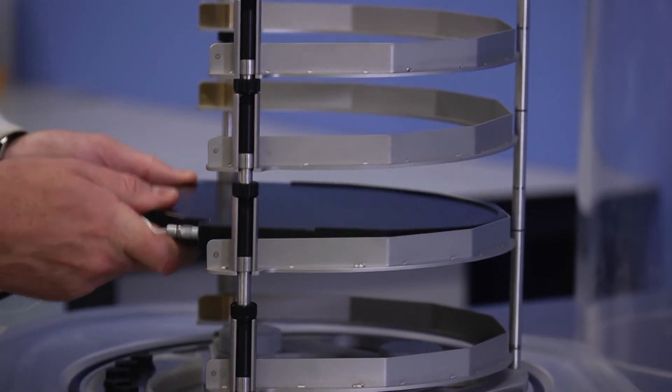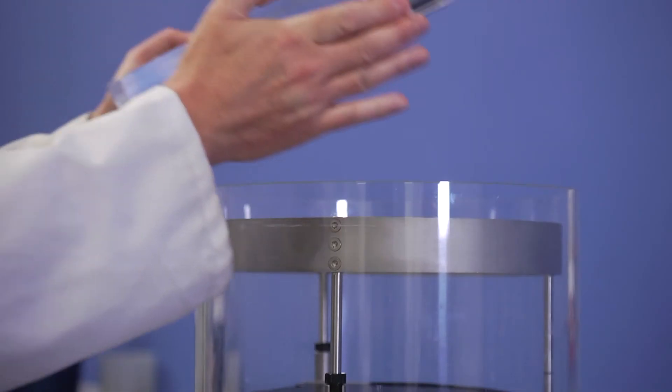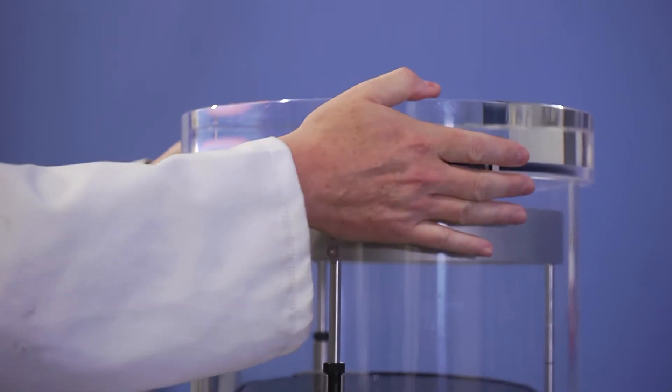The equipment is also very easy to install. It's simply a case of connecting up the power supply and pumps.